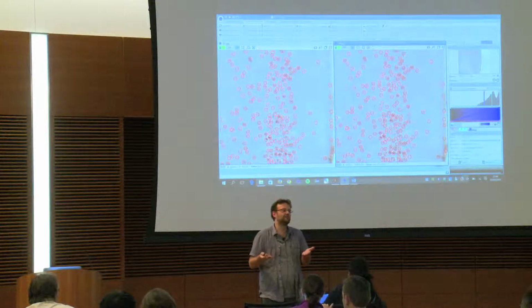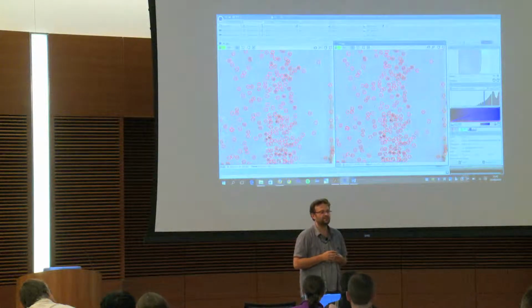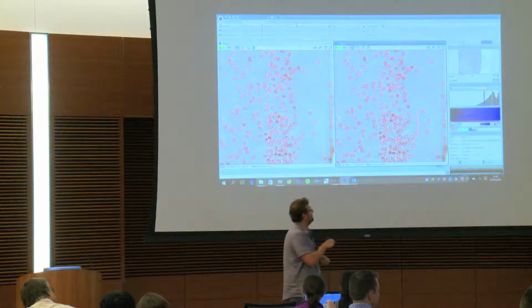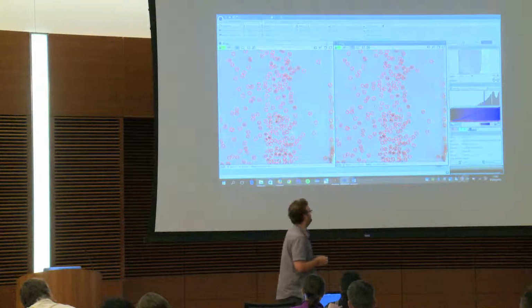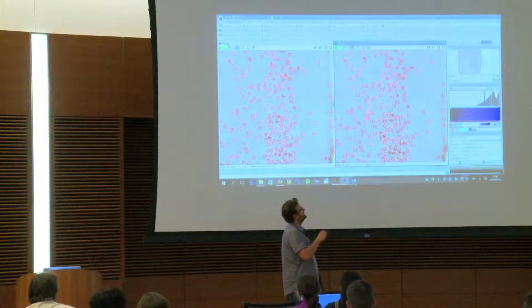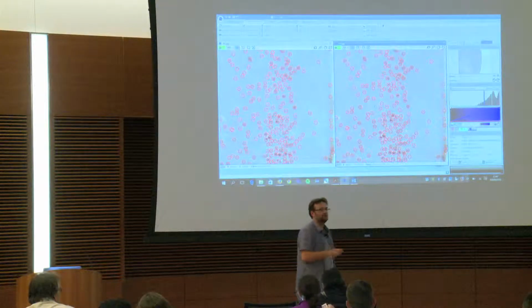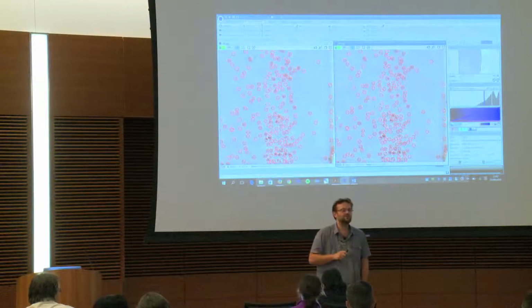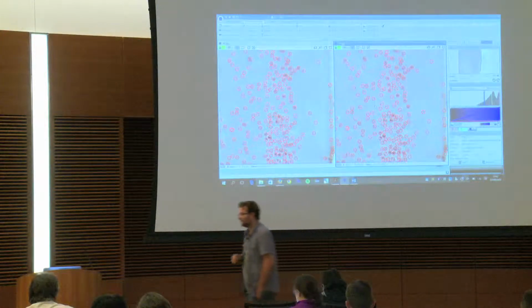But it's wrong, let's say 90%. If I have a score of 90%, it's okay. Never try to correct it, because you're going to indeed make the thing worse. And because it's very easy to do this, concentrate on producing this sample, and then we can compute 100 images if we wish to see the result of this. Okay?